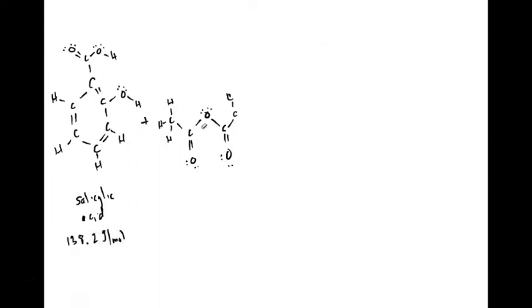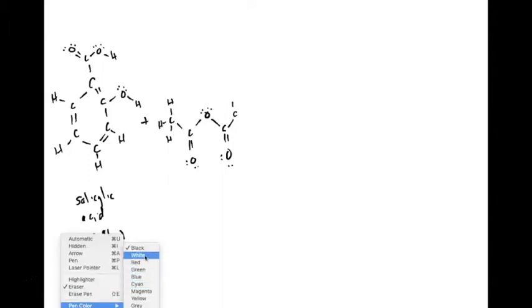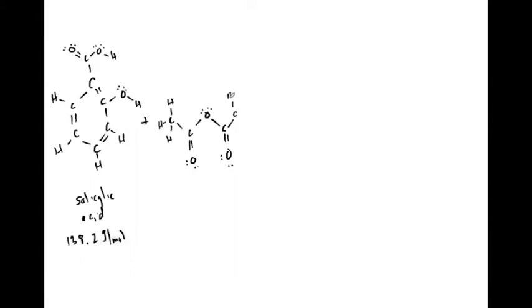That needs to be a hydrogen, not a carbon. So we're going to react the salicylic acid with acetic anhydride, and this acetyl group, the C double bond O CH3, is going to attach to the oxygen where the hydrogen is, right? And that's going to form our acetylsalicylic acid, aspirin.